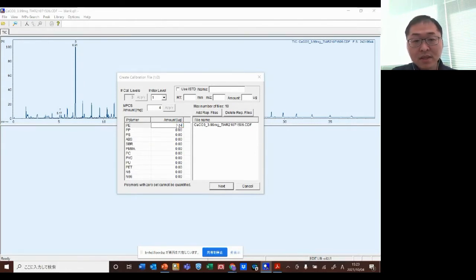So in this case, polyethylene in 4 milligram, we have 145.5 microgram of polyethylene. So I do the rest the same. So 5.2, 5.3.